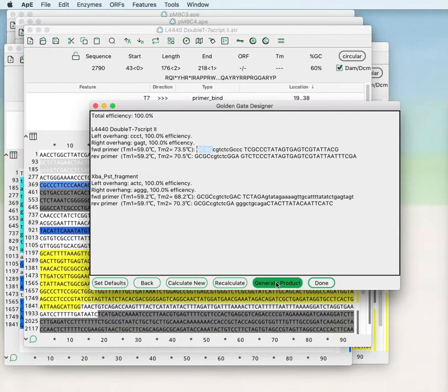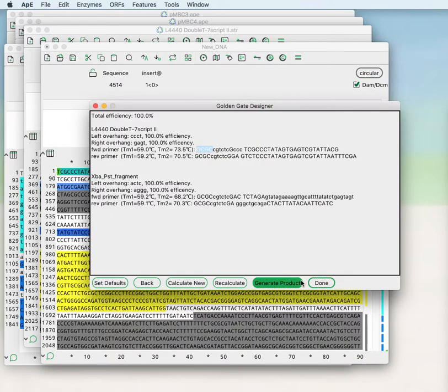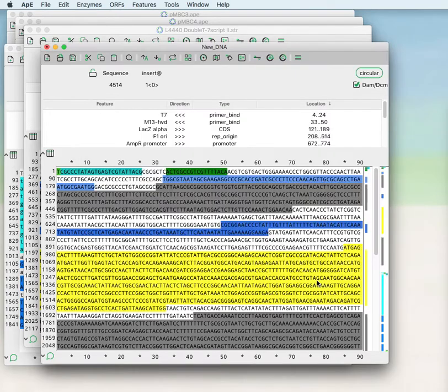If you click generate product it will generate a new sequence window with the product of the Golden Gate reaction and if you are not interested in designing any new Golden Gate reactions you can click done.